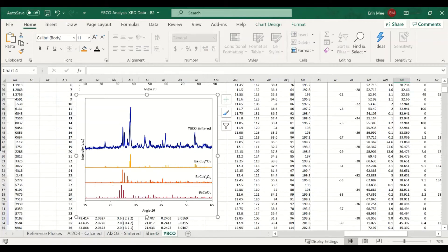This video will show how to graph a reference spectrum alongside XRD data so that we can compare and contrast how the data corresponds to different crystal structures.